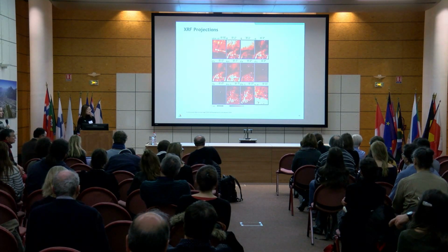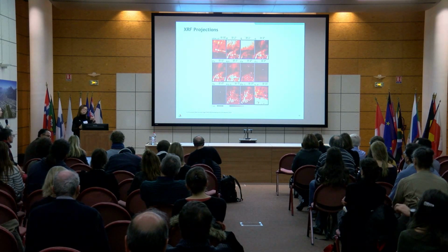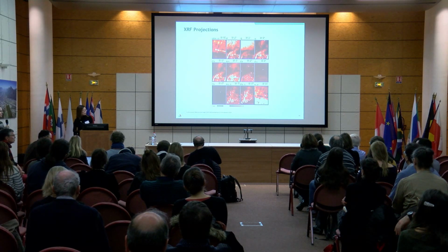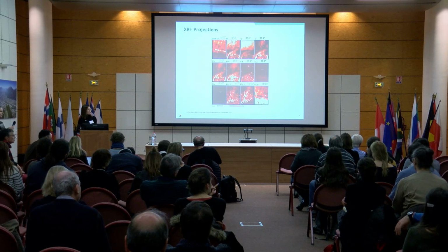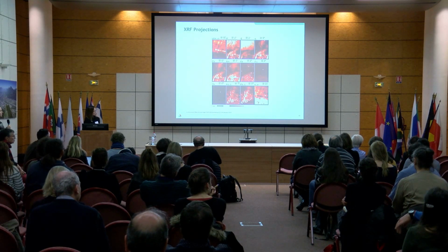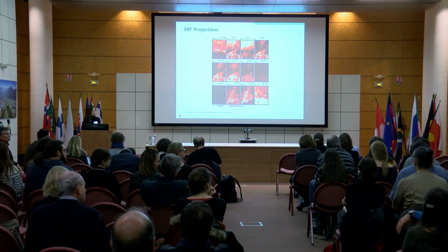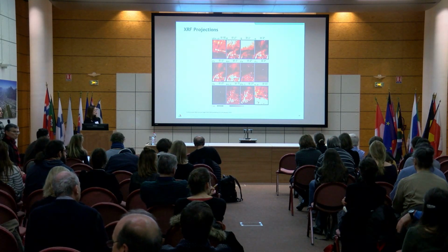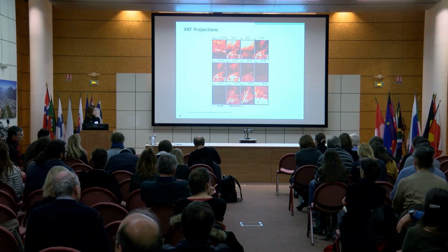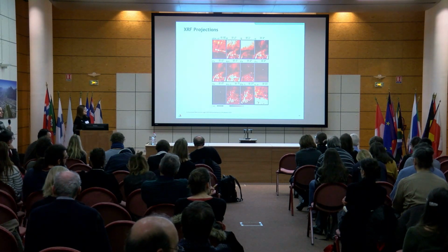Yes, it's important. Over here we see pretty much the signal from towards the surface. Indeed, we detected it a couple of times because we were under vacuum at ID21, so we had a very good sensitivity to phosphorus, and also because in the samples we measured, the ink was on the surface. But in your case it may be a bit challenging to probe the signal and link phosphorus to an ink which would be internal.